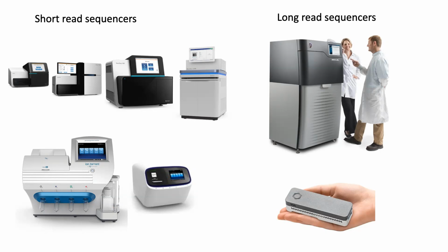So as we saw in the chromosomes, there are huge areas of repeats that are impossible to map with short read sequencing. So now as we reanalyze the human genome, these long read sequencers are playing a major role in that. On the other hand, Oxford Nanopore has much lower precision per nucleotide, but allows us to study whole genomes of individual bacteria and even human samples, but at a much lower cost. So whatever way we go, with whatever type of a sequencer, we're going to be generating a lot of data. So let's think about what this data contains.